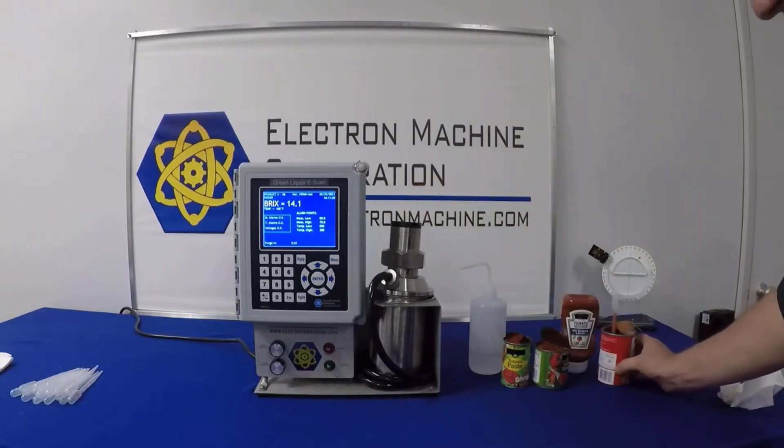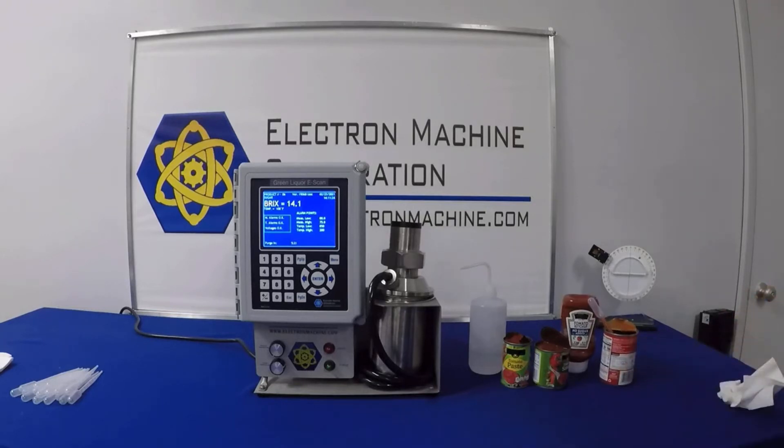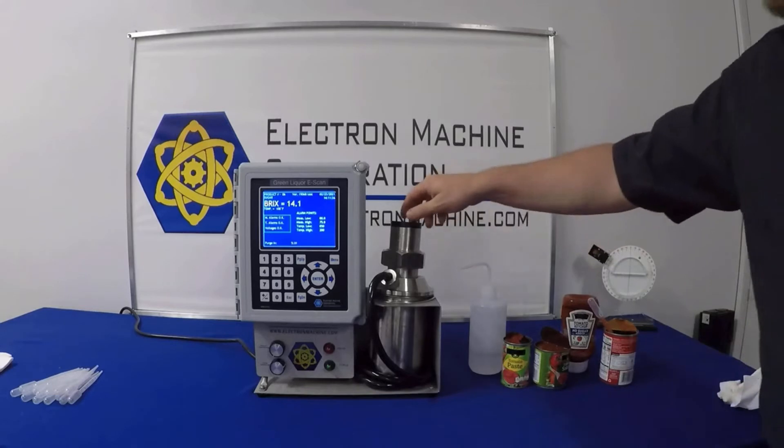Here we have what we would read as a 14 Brix unit. That doesn't necessarily measure how much sugar is in there. It's just letting you know that most of the water has been evaporated out of it. So we'll switch products.